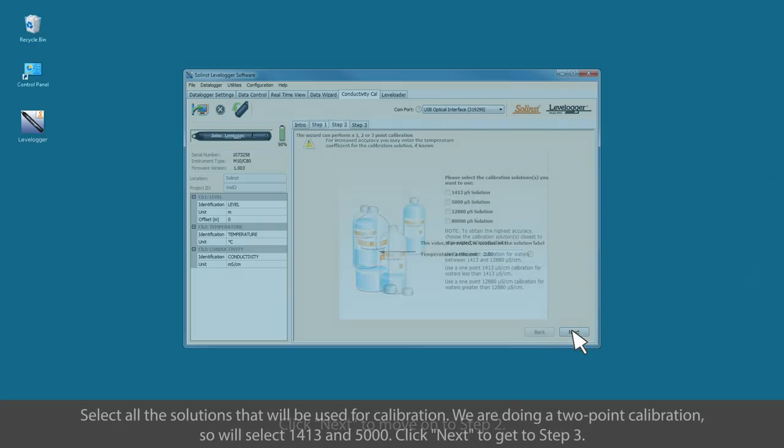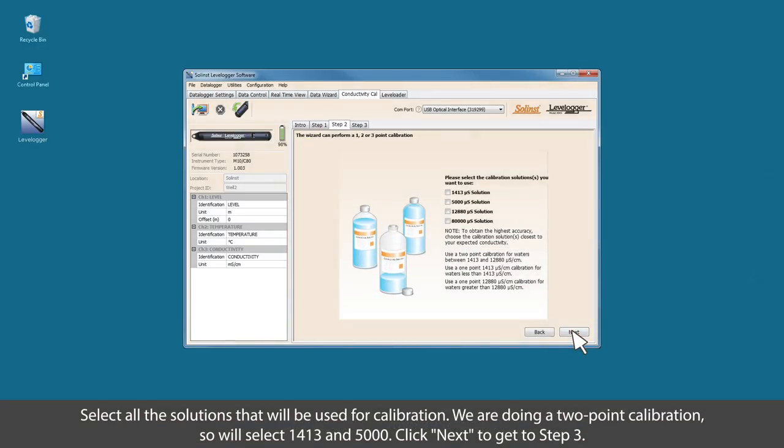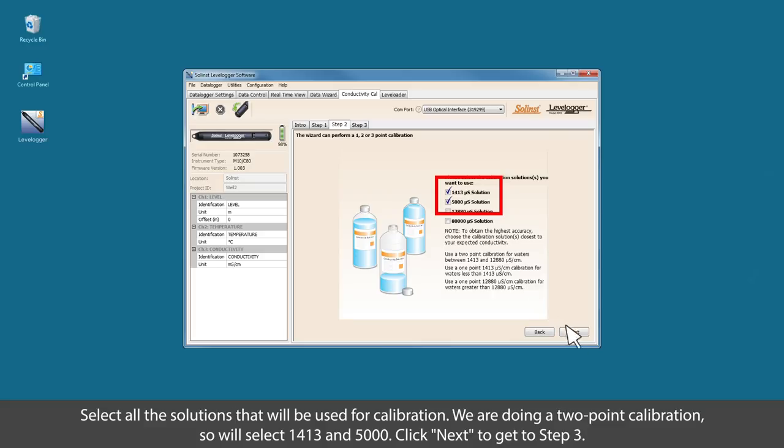Select all the solutions that will be used for calibration. We are going to do a two-point calibration, so we'll select 1413 and 5000. Click next to get to step number three.